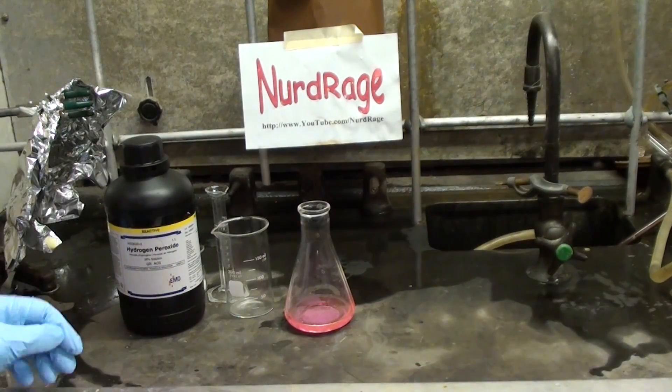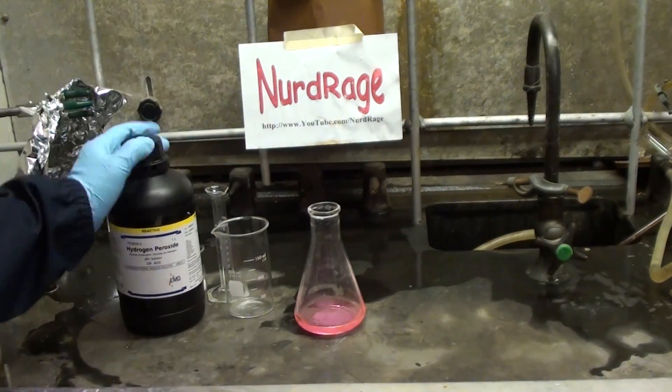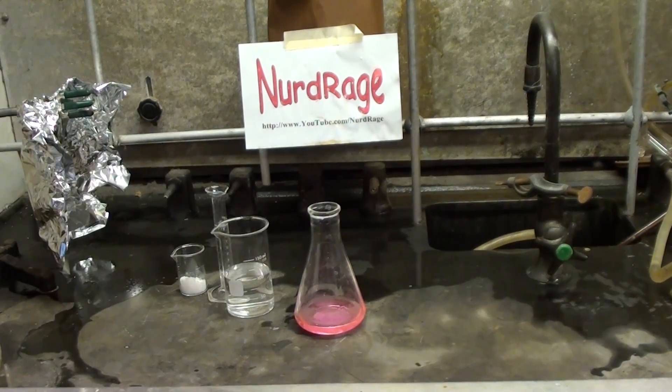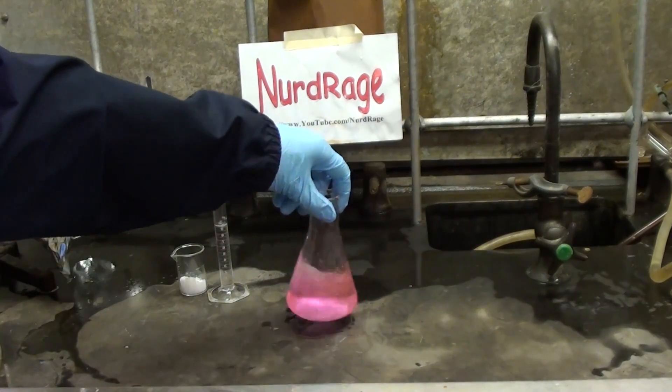To do this, start with 50mL of detergent. If you can blow bubbles in it, it'll work. Now we add to it 100mL of 30% hydrogen peroxide. This peroxide concentration will cause burns so be careful when handling it — wear gloves. Now mix it up.